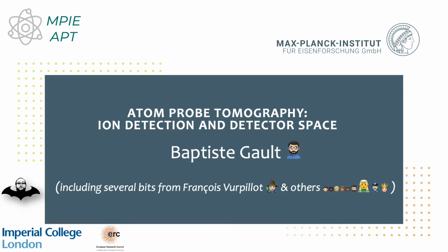Hi, I'm going to keep going with this series of lectures, and this lecture will be dedicated to how we detect ions in the atom probe and then what we can learn from looking at the detector space. And again, some of the bits and bobs that are in there were taken from colleagues, including François Vurpillot, but also others.